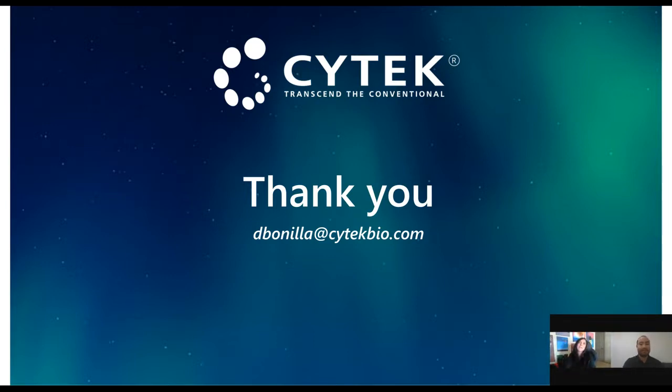Yeah, our recommendation is to try both options, with and without extraction, because there are some cases where the autofluorescence is not really high, it's low, so the correction, since it's based on the median from the unstained, will give you unexpected results or more spread in the negatives. So yes, that extraction can be detrimental, and it's a good point.